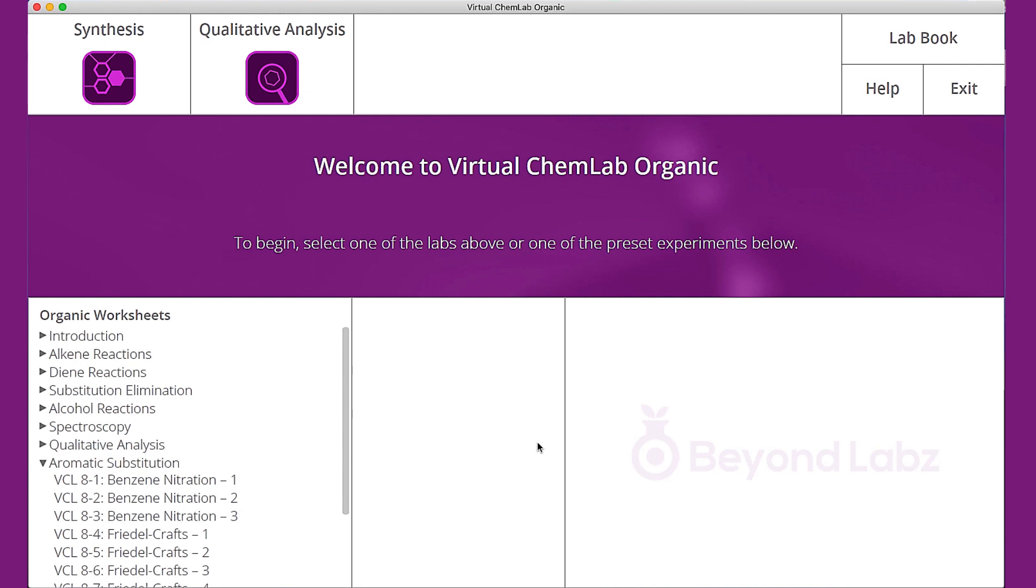Hi everyone. My name is Kelsey with BeyondLabs. Today I'm going to show you how to do a distillation in the organic virtual lab.